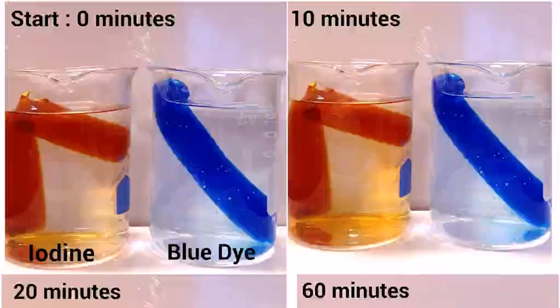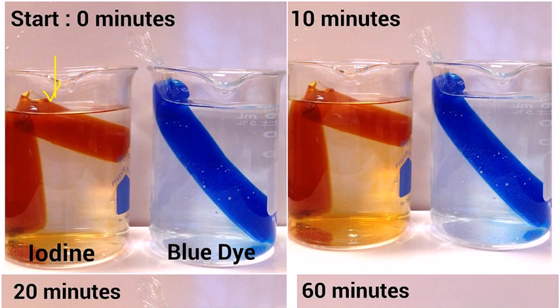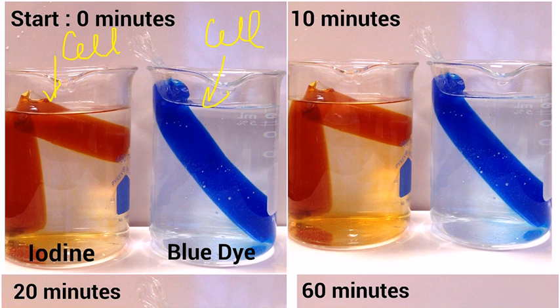So to show this, I've set up two beakers, and in each beaker we have what are called cells. The cells are just pieces of dialysis tubing that have been tied off and filled up with chemical color indicators. In the cell on the left, we have a chemical indicator called iodine, and in the cell on the right, we have blue dye.